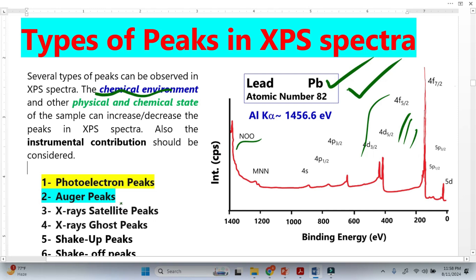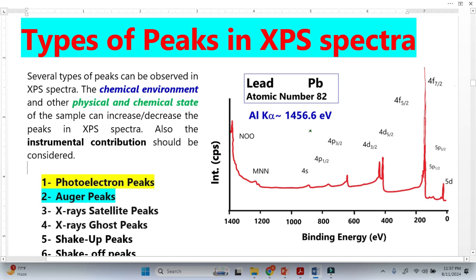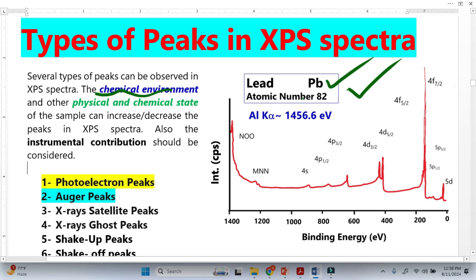In today's video, I will be talking about how we will recognize and identify Auger peaks in an XPS spectrum. We know that in XPS spectrum there are a large number of peaks. The number of peaks depends on three parameters: the chemical environment, the physical and chemical state of the sample, and instrumental contribution. For example, this is the XPS spectrum from lead, and since lead is a heavy element, we have a large number of peaks — these are photoelectron peaks, and these are Auger peaks.